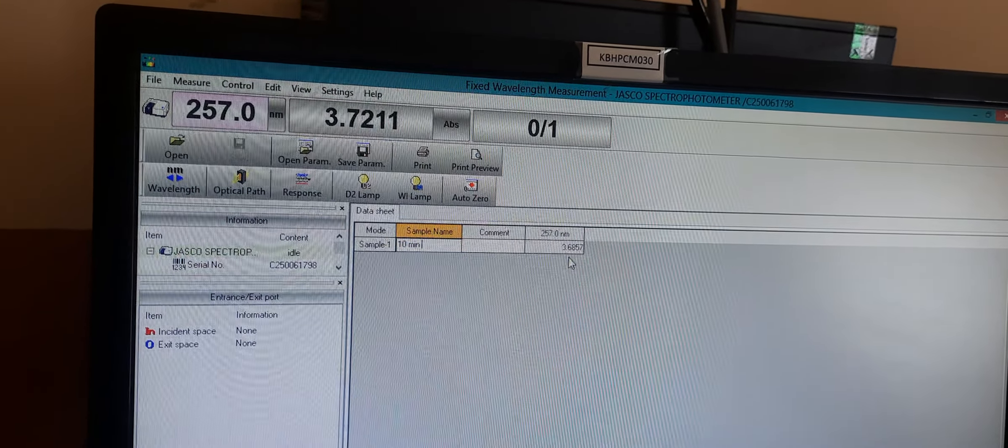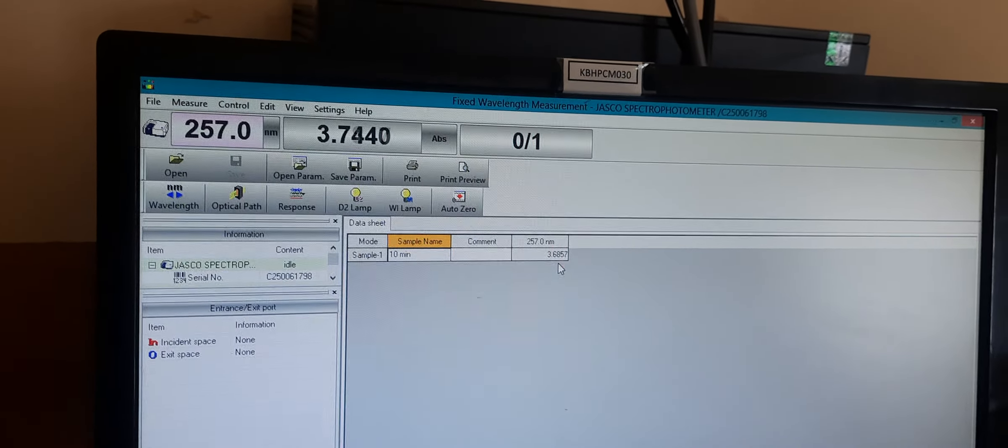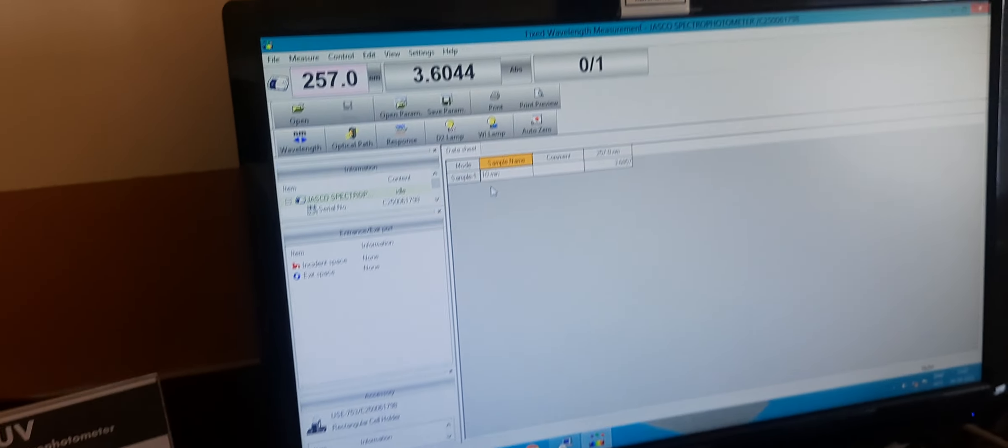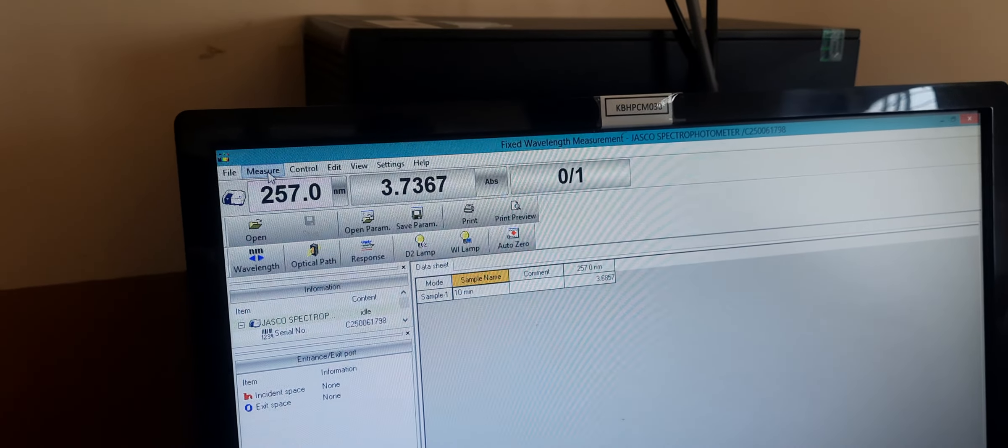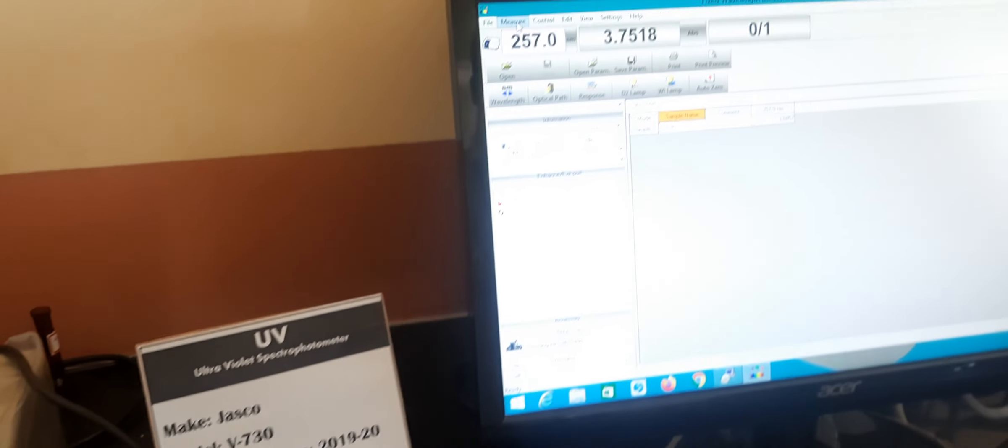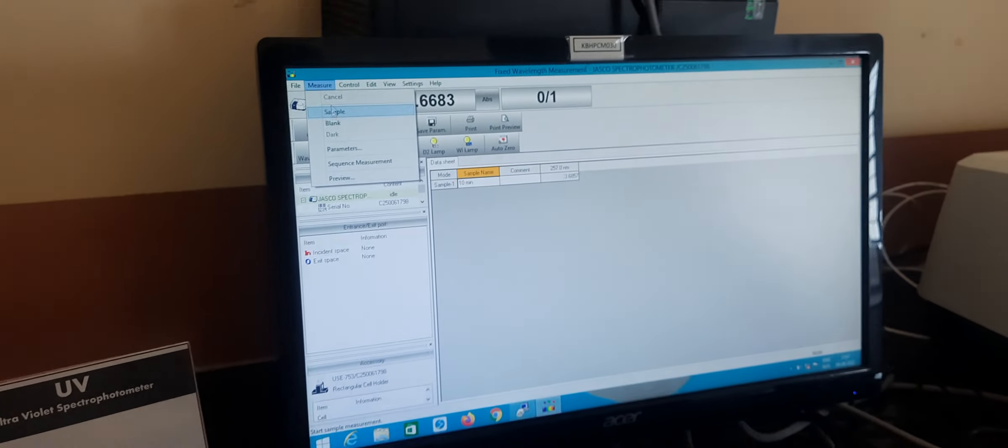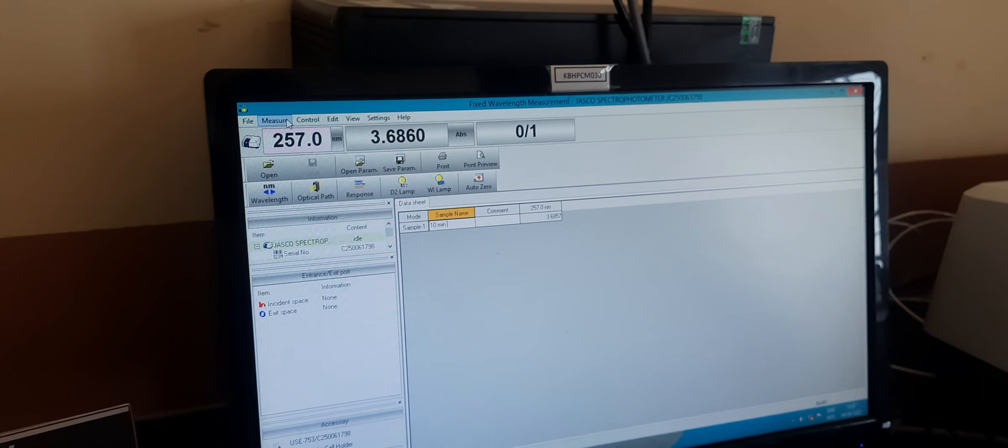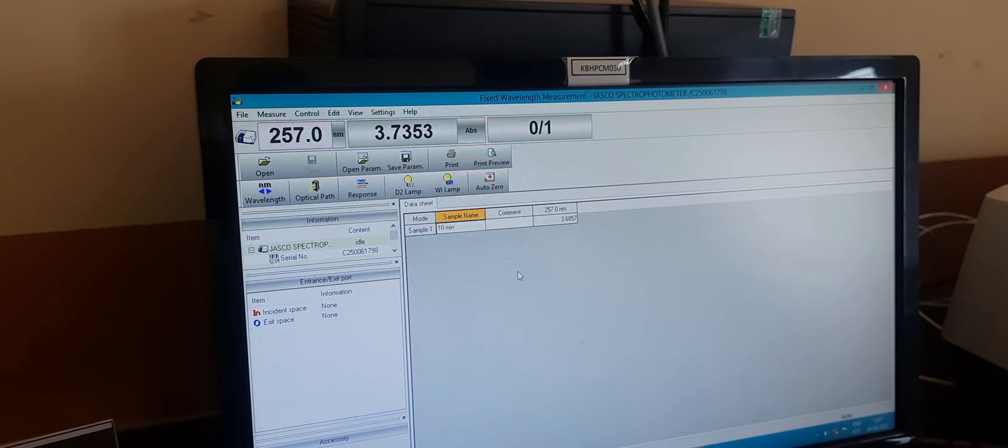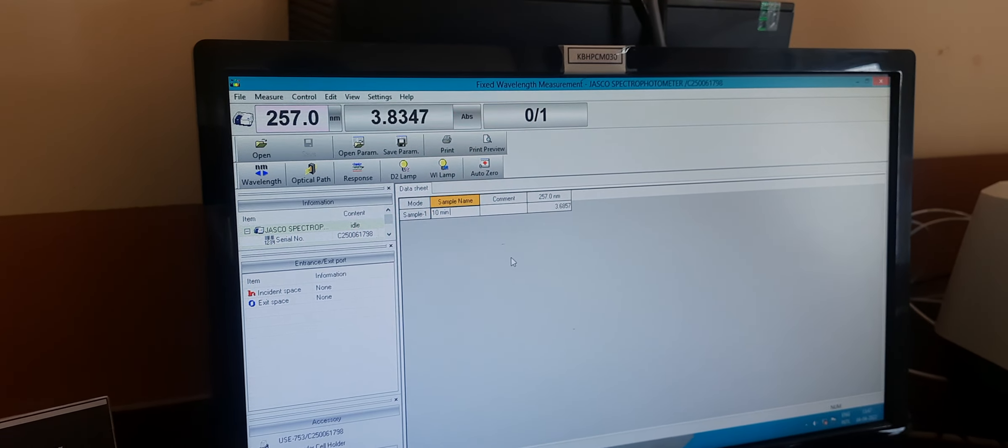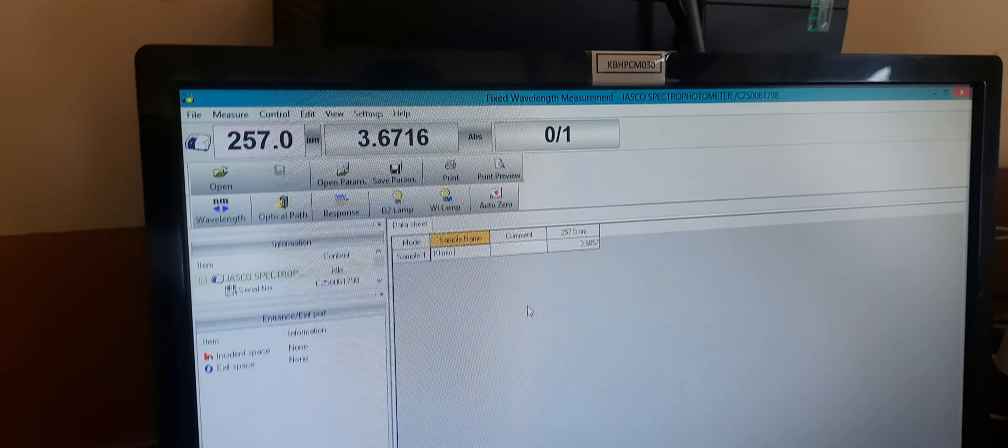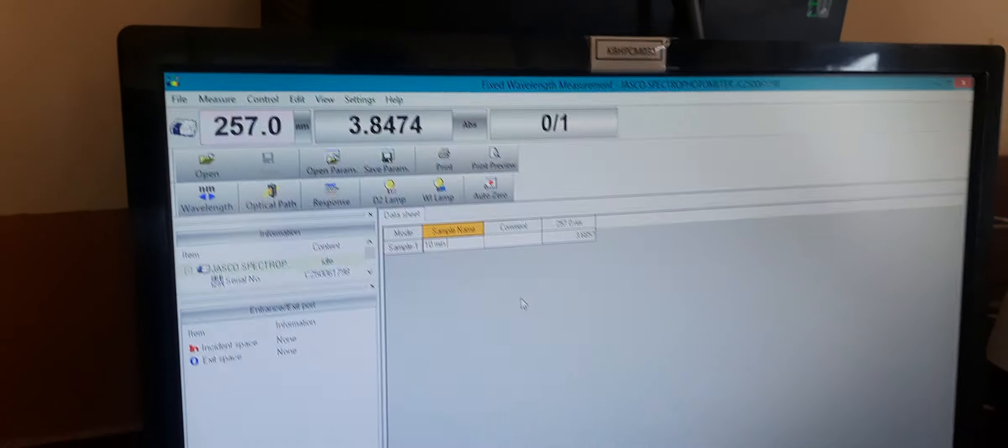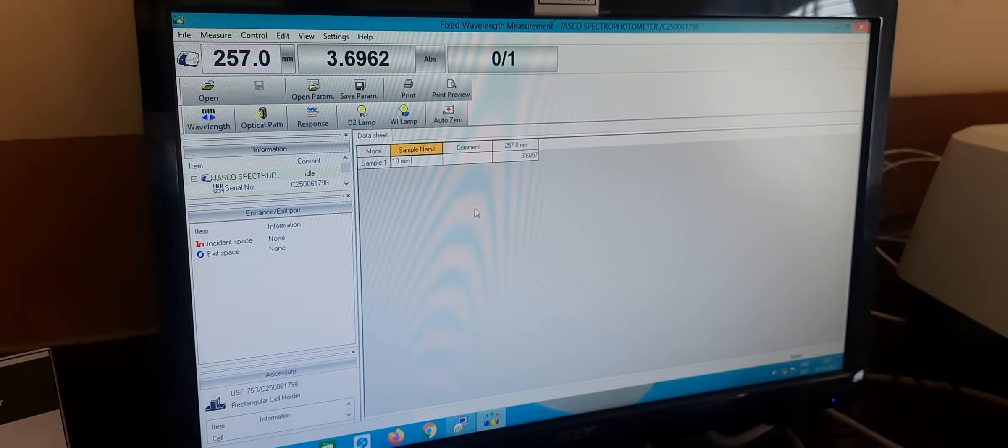Take another sample, put it into a sample cuvette, and measure. We get the absorbance of that particular time point sample which we have taken from the dissolution test apparatus.